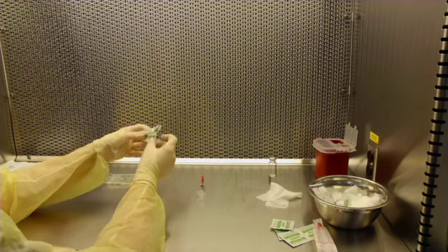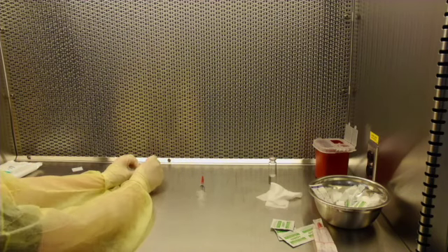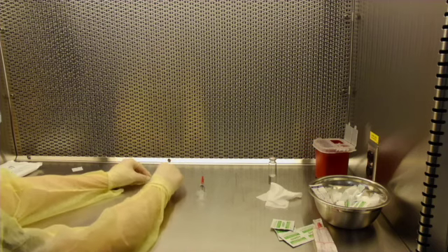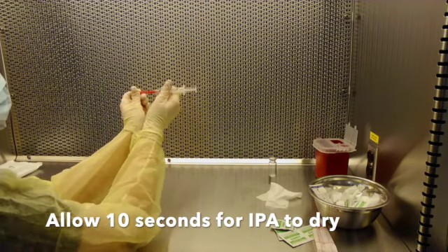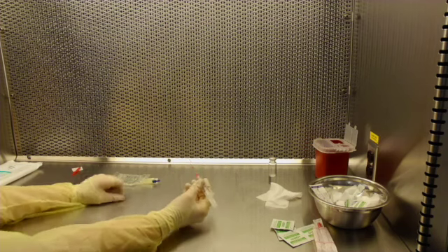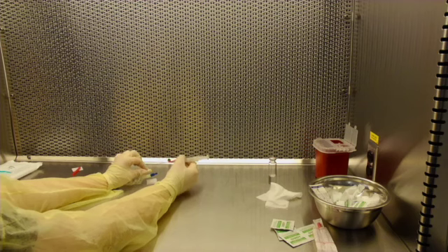When you're ready, move your vial out of the way so nothing is going to block your injection into your bag. Wipe your bag port 3 times in the direction of the airflow, placing an alcohol swab underneath the injection port. Safely uncap, placing the needle cap facing your HEPA filter. Support the injection port with your hand and go straight in through the center.